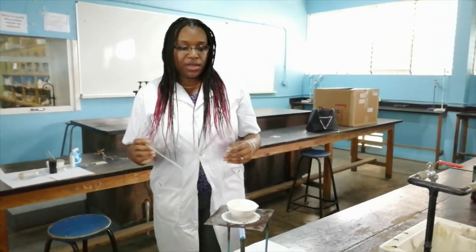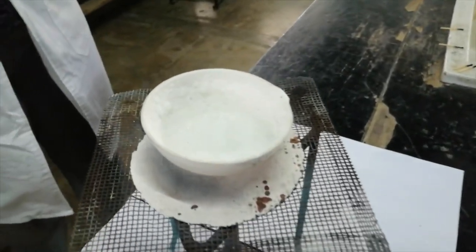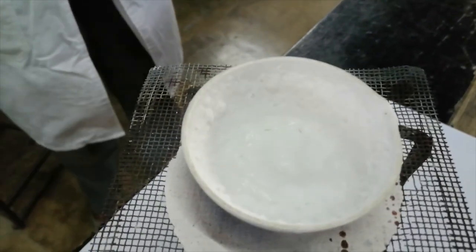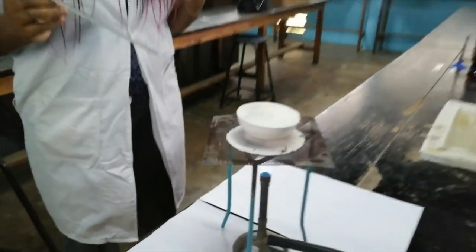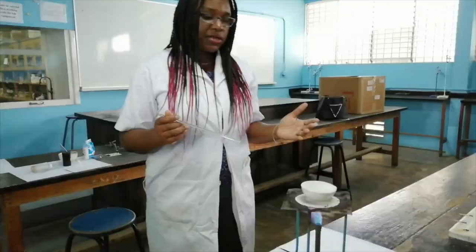Let us just do another close-up and see what's going on. Remember, you use this technique when you want to recover the soluble solute. The table salt did dissolve in the water — we did not want to recover the water, we wanted to recover the table salt from it. So we've evaporated the water and now we've recovered our salt.